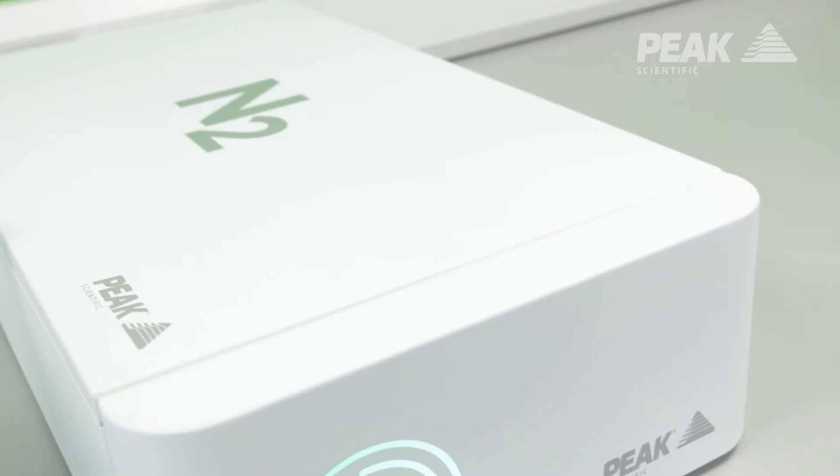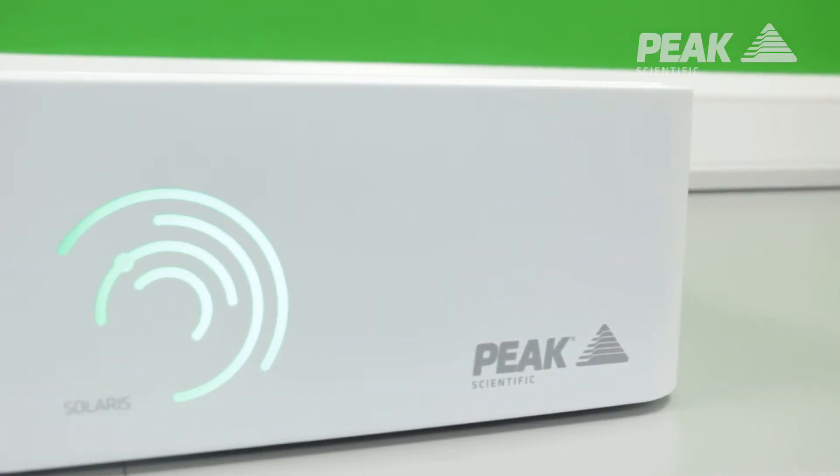The Solaris XE has been designed as an ideal solution for LC-MS instruments, for compact mass spectrometers, and also for ELSD instruments — and it could actually supply multiple ELSD instruments at once.